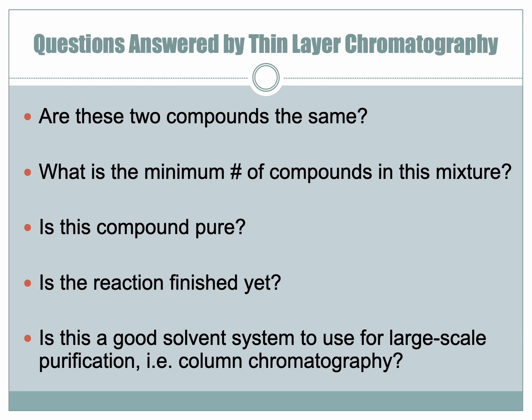And so essentially what TLC allows us to do is to check the number of components in a system, the number of different compounds. We can count them because they all have different properties, and we can separate them using thin layer chromatography and then count them.